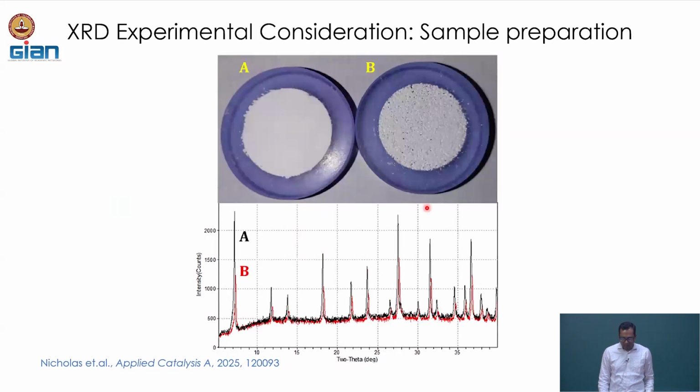Another thing is the particle size or grain size. These are two examples: in one we have really small grains, between 100-150 microns, whereas in the other case we have much larger grains, some 300 to 500 microns, and as you can see, the surface is not as smooth. When collecting the XRD, the fine particles give very nice and clear peaks, but for the others the intensity is really small. Case B here has almost half the intensity of this case. Is there any question?